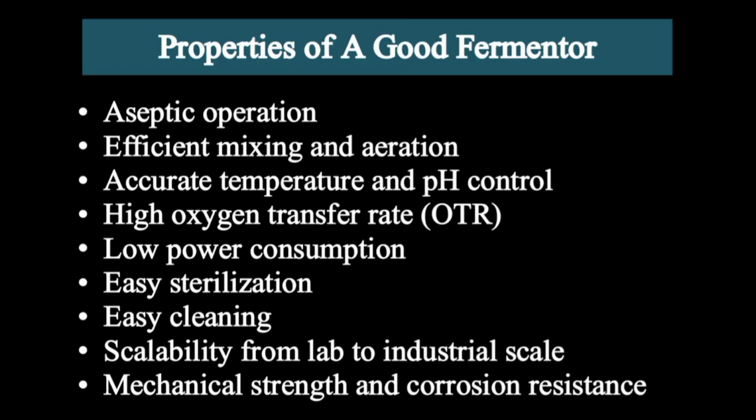Next, what are all the properties required for a good fermenter? First, it should have aseptic operation, efficient mixing and aeration, accurate temperature and pH control, high oxygen transfer rate, that is OTR, low power consumption, easy sterilization, easy cleaning, scalability from lab to industrial scale, and mechanical strength and corrosion resistance.